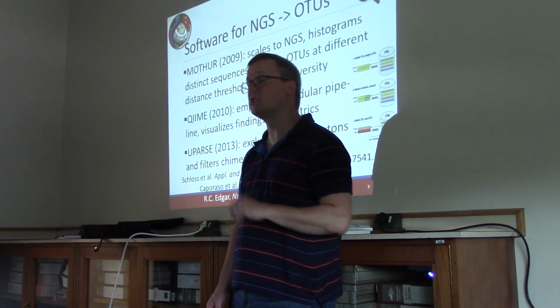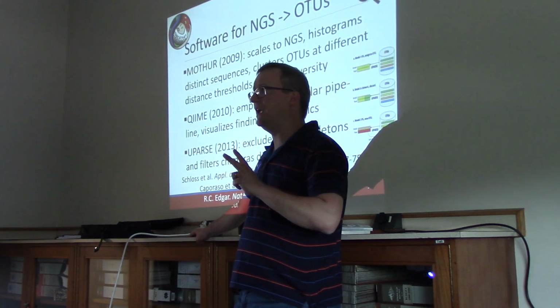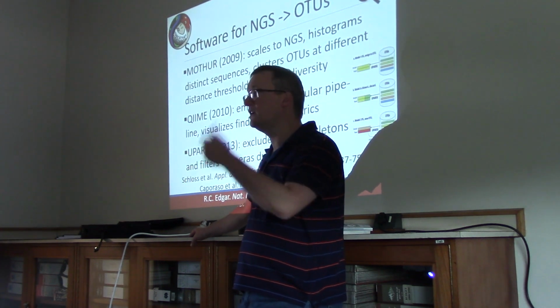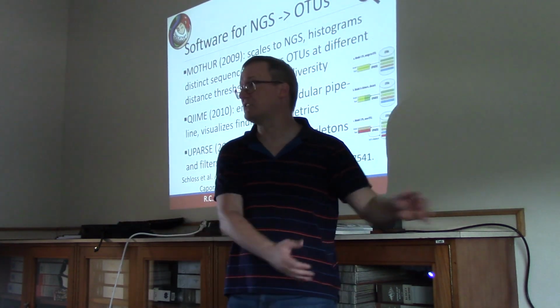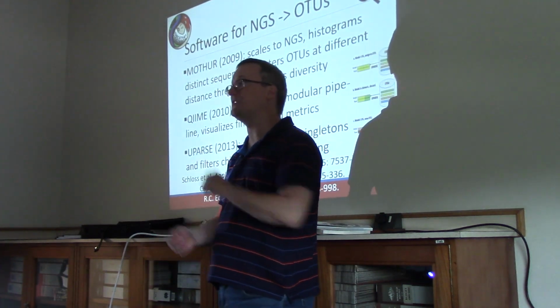Typically not. So we've already mentioned two reasons why you're going to see a large number of one-off sequences: biological variability and sequencing variability. So you can imagine a long tail then of many, many, many sequences that are seen only once. There are going to be some sequences that we see very, very frequently.